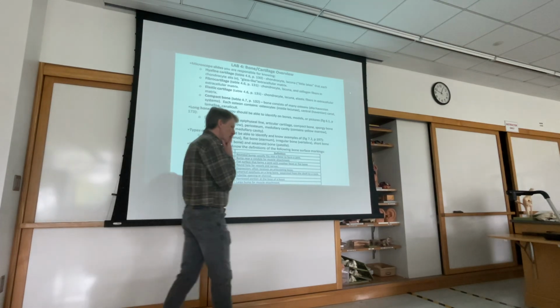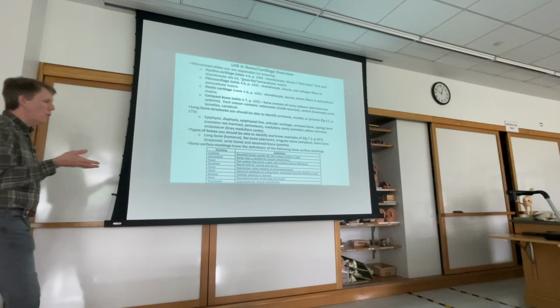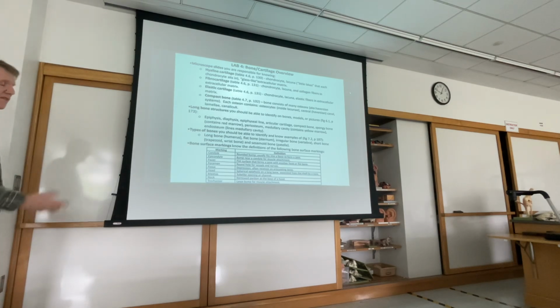And so if I were to point at one of those things and say, what is this? It can be hard to know what I'm talking about. Am I pointing at the cell that's there, or am I talking about the space that the cell's inside of? So to get around that, I usually pose the question in such a way to make it clear. If I say, what is the cell here? Then say osteocyte or chondrocyte. If I say, what is this space called? Then you'd say lacunae. All right, I'll show you what I mean when I get there, but I just wanted to point that out before I go on.